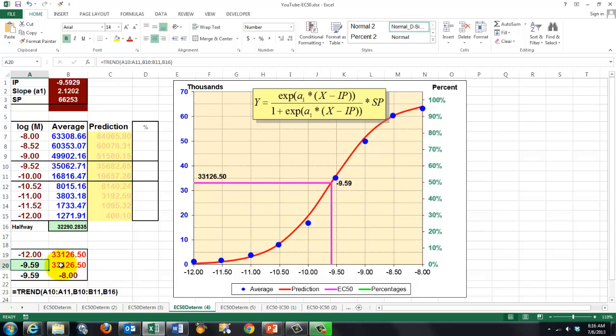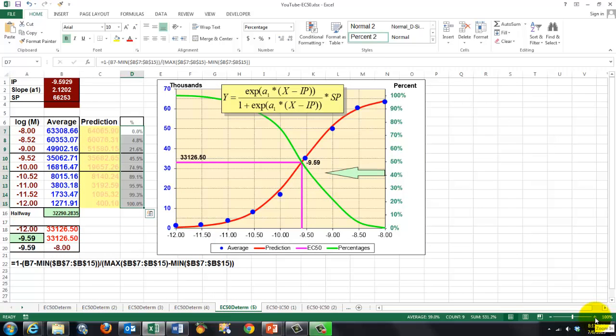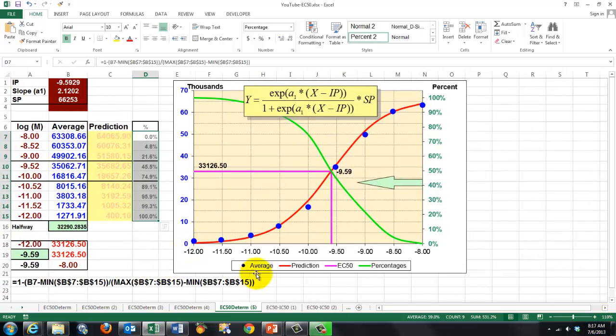So what is the corresponding value? If we follow this formula, and I think we should, then it should come up with that point, if the curve is correct. Correct? So I have in here the calculation, exponent divided by 1 plus the exponent, etc. I added one more feature, which is really redundant, but just to show you that everything works correctly.